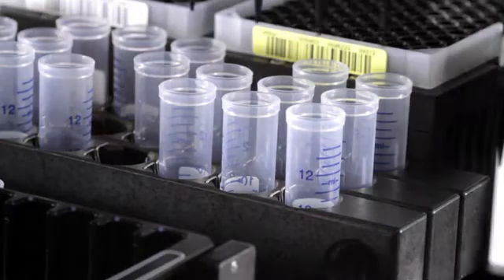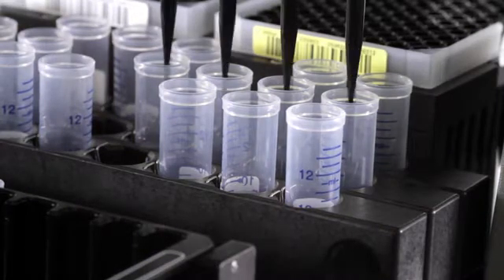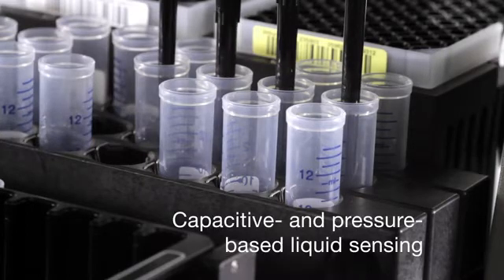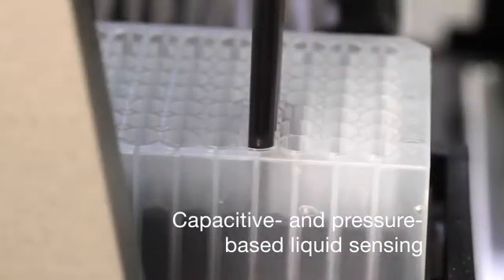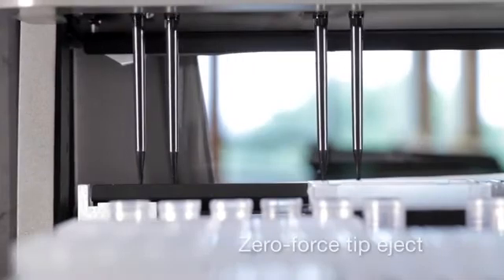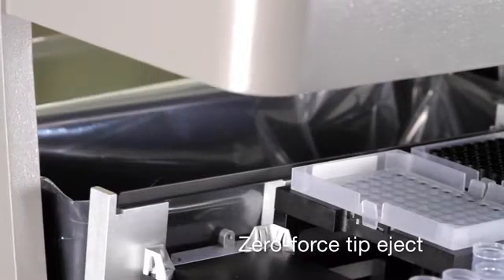Samples are transferred from the primary tubes to a preparation plate. Both capacitive and pressure-based liquid sensing minimizes tip contact with biological fluids and detects plugged tips. The MaxPrep instrument uses a zero-force tip eject which removes the formation of aerosols.